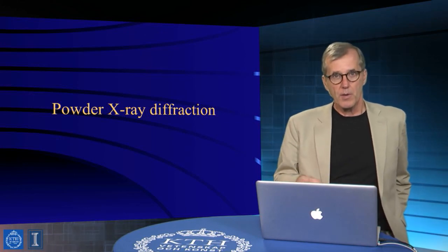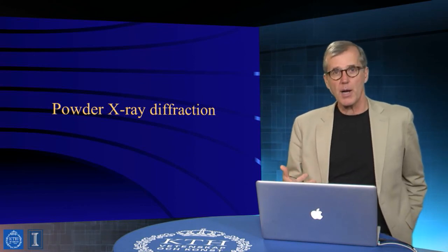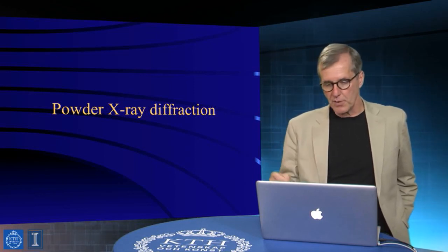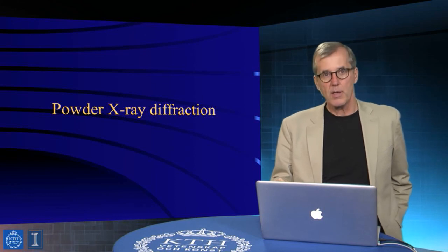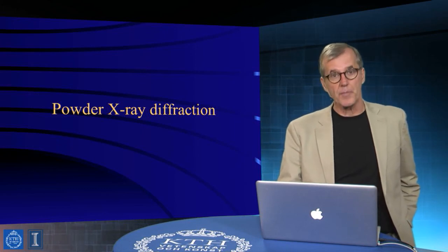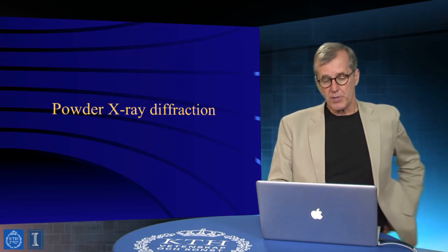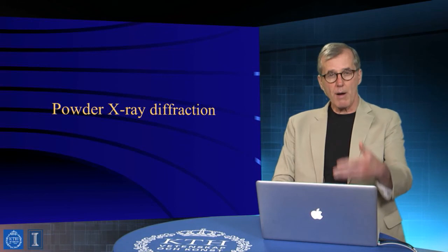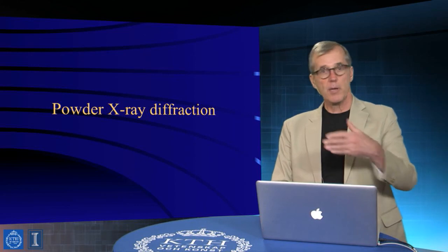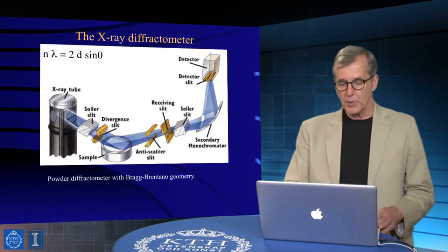But for the kinds of materials we use for structural purposes or whatever, they're much more complicated. They may contain amorphous components, they're component mixtures, etc. And in fact, they may incorporate things in powdered form, where powders have vastly different sizes, and that all has an impact on what you would be able to measure and see with X-ray diffraction. So powder X-ray diffraction probably will be the more important and common protocol that you would use in a measurement in a material-centric context. So the diffractometer basically lets you do a number of things.